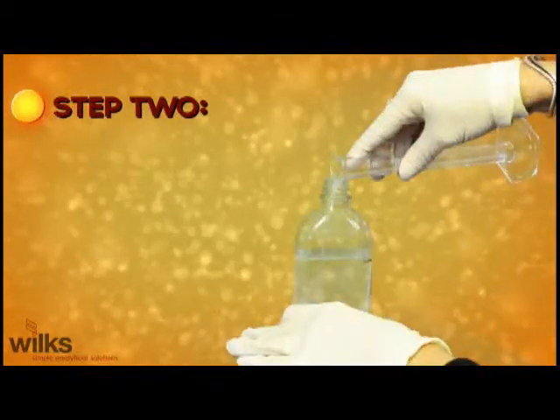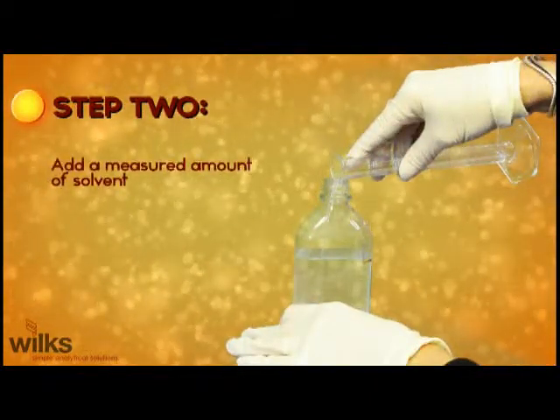Step 1: Collect a measured amount of sample. Step 2: Add a measured amount of solvent. Step 3: Shake for two minutes.